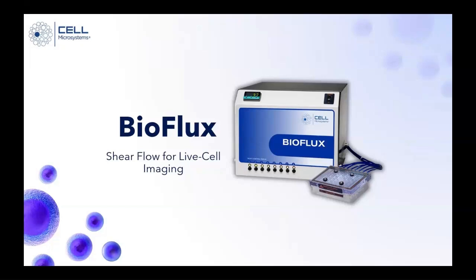It will depend on whether we can tag these with fluorescent markers so that then we can quantify via imaging how these interactions are taking place. And then the imaging and the quantification will depend on the capabilities of the microscope. So we're thinking about fluorescent capabilities as well as pairing of different objective lenses and different magnifications. So the BioFlux is really a combination of shear flow and live cell imaging.